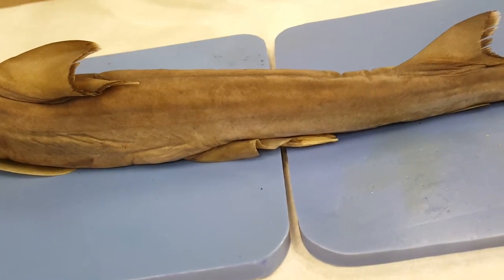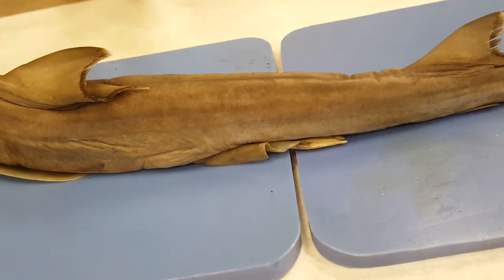That's basically our external anatomy of this shark. Look forward to the internal anatomy.